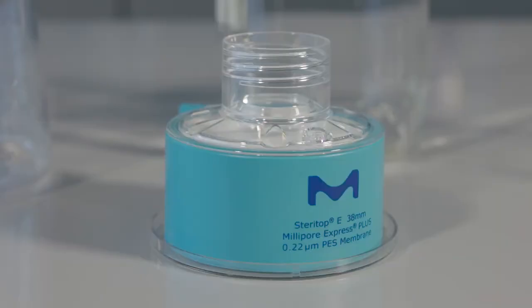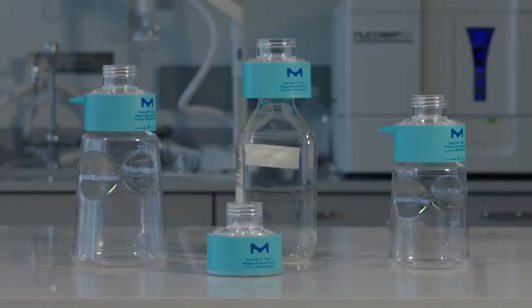Eliminating the funnel has greatly reduced the plastic content of the system. Beyond improved sustainability, the smaller device results in a significantly reduced footprint both in storage and biohazard waste disposal. In addition, all packaging utilizes 100% recycling compatible materials.